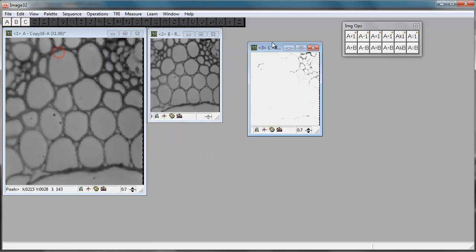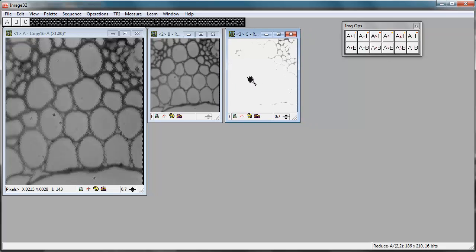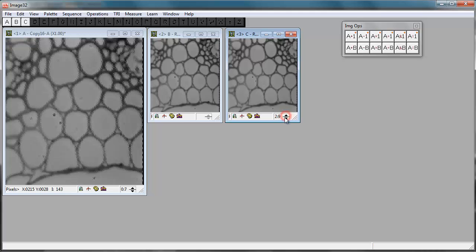And what you can now see is that the pixels have been saturated, but I can use the display translation bits to shift the image by 2 bits. Now effectively the intensity value in this image is 4 times the intensity value in the original images.